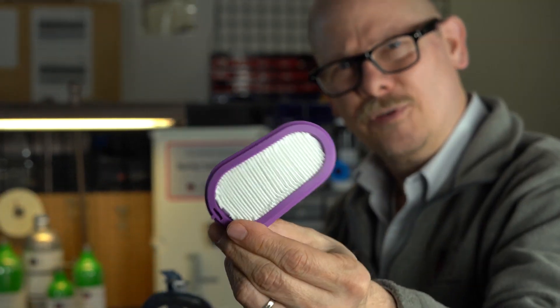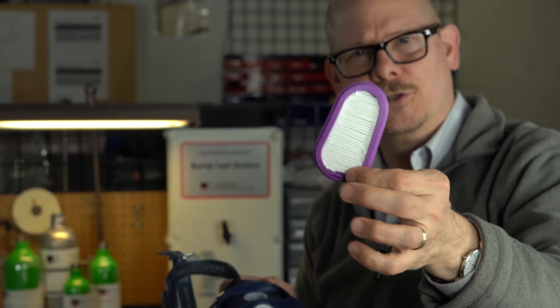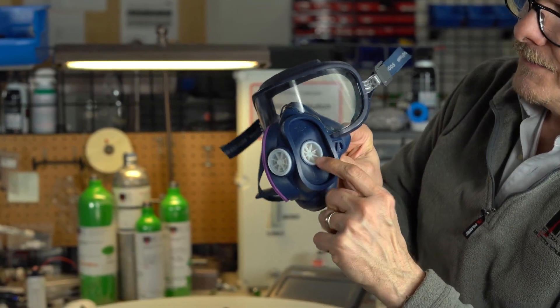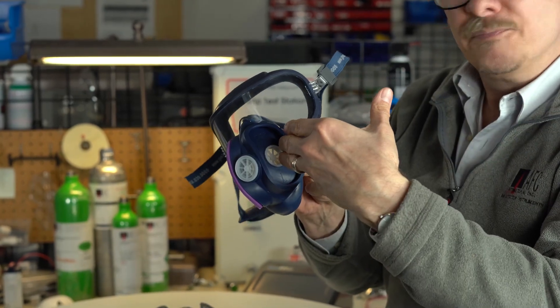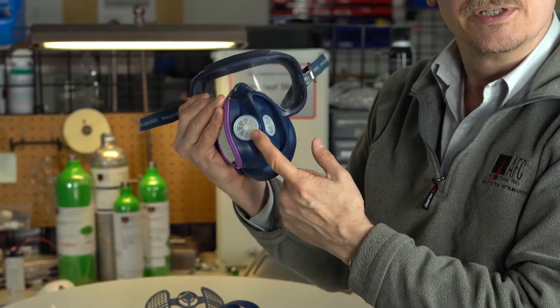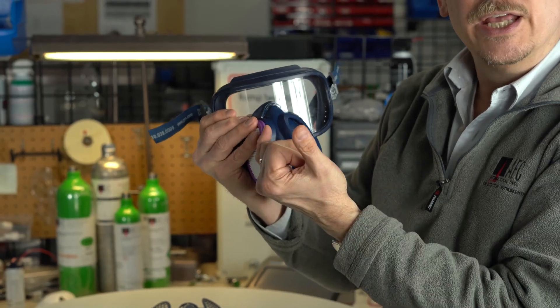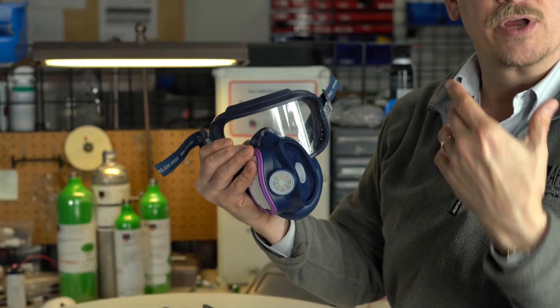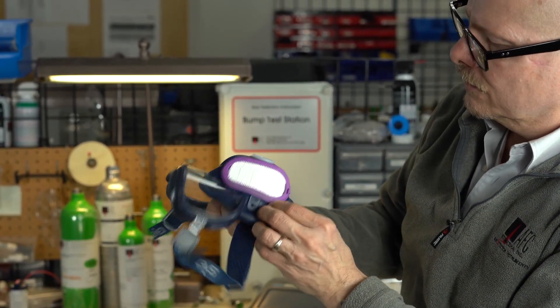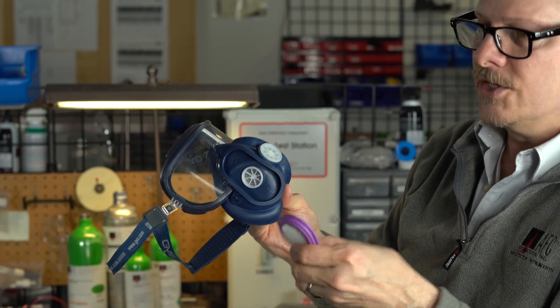You can see all the different folds in there. Purple means P100 — high efficiency filters. That's your highest protection we have for particulates. You'll also see the inlet valve that opens up when you breathe in. When you exhale, it closes off and your exhale breath goes through this front valve up here. That one closes when you inhale and opens when you exhale. So that's how you escape your exhaust breath — it's going to be through that part. It's got a top and a bottom, and you'll see a left and right icon on the mask itself. These are your filters.